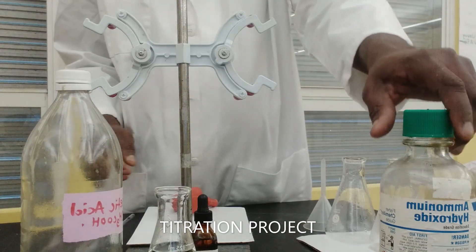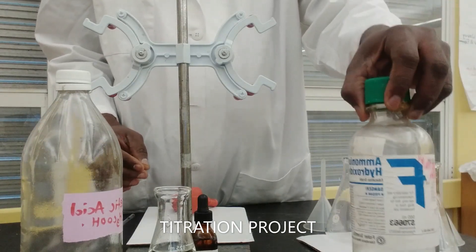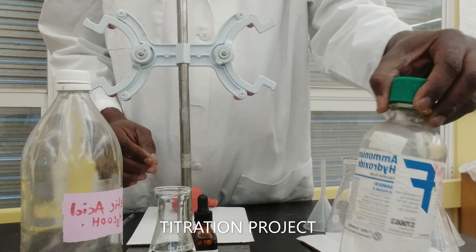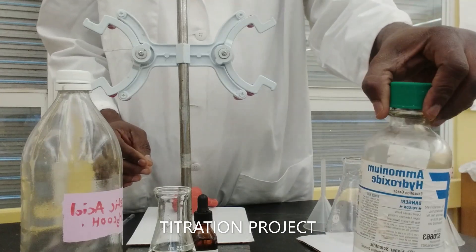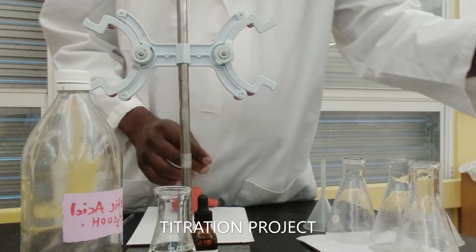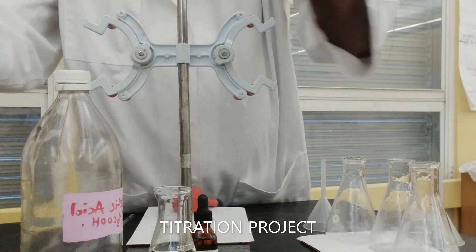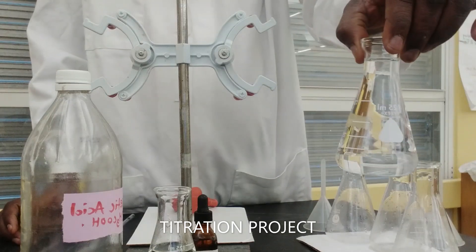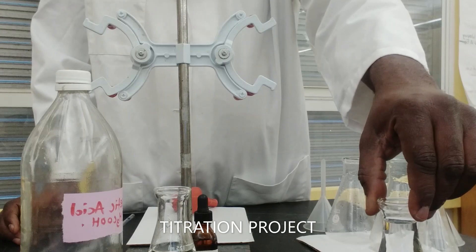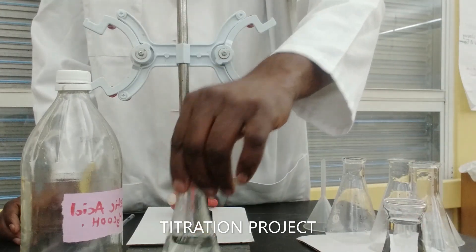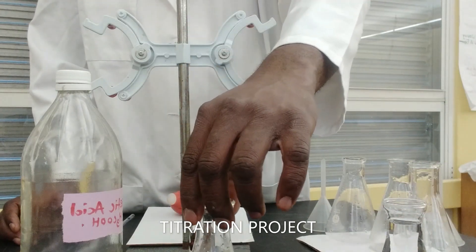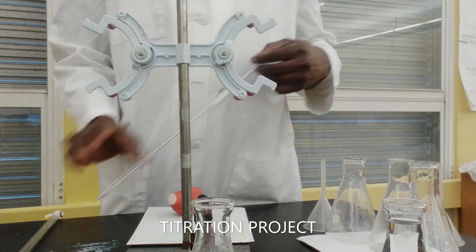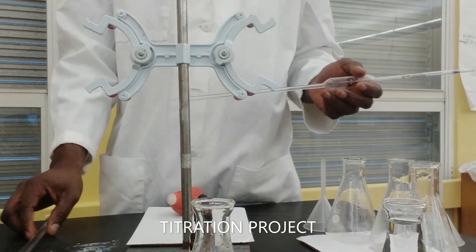Acetic acid is commonly called vinegar or also known as ethanoic acid, with a weak base ammonium hydroxide, which is commonly found in some cleaning reagents in the house. I'm going to set this aside.